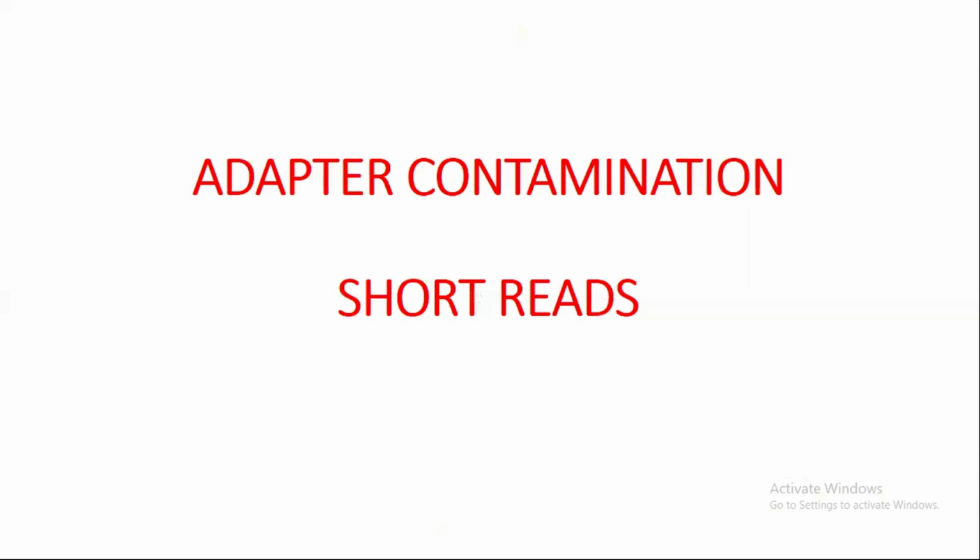Now coming to adapter contamination and short reads. This is a very important concept in data pre-processing, because if you are not confident about adapter contamination and short reads, there will be a problem in pre-processing and you will get confused about how to pre-process your sequencing files.